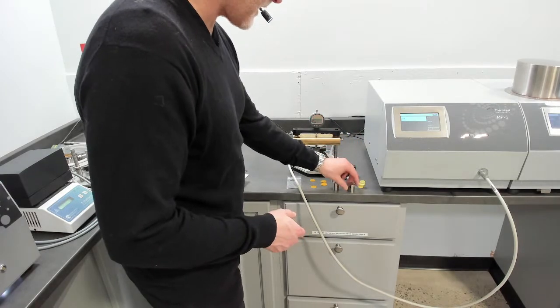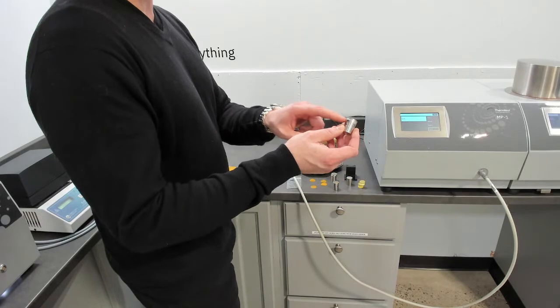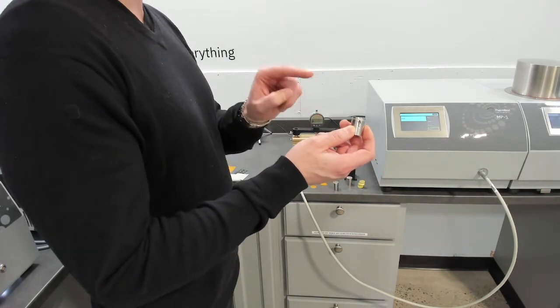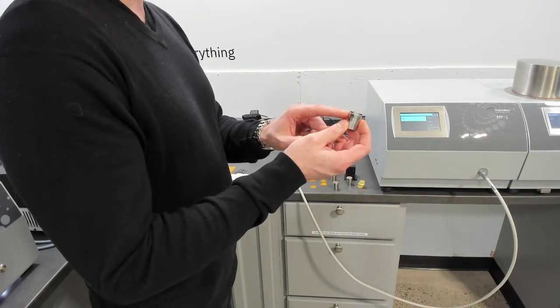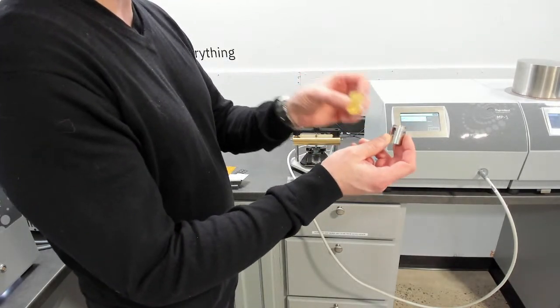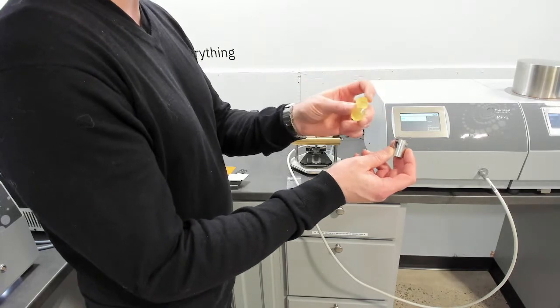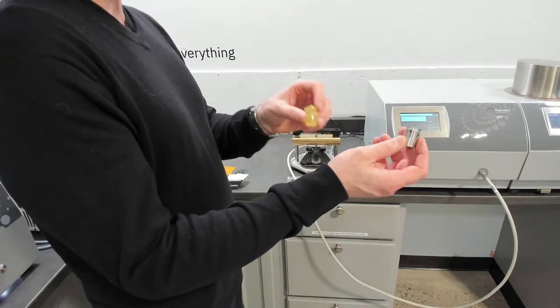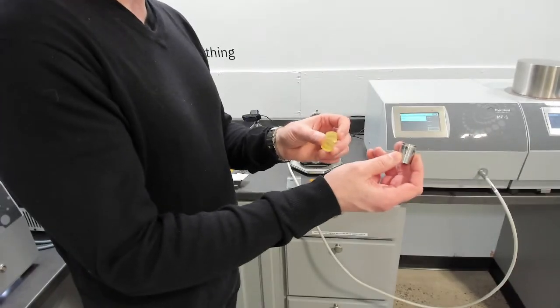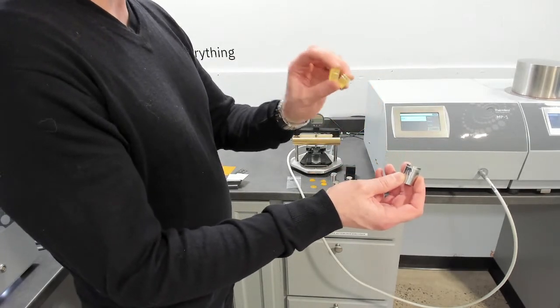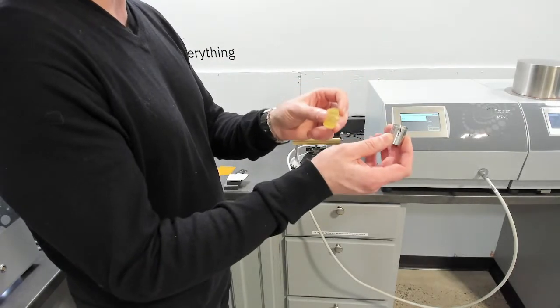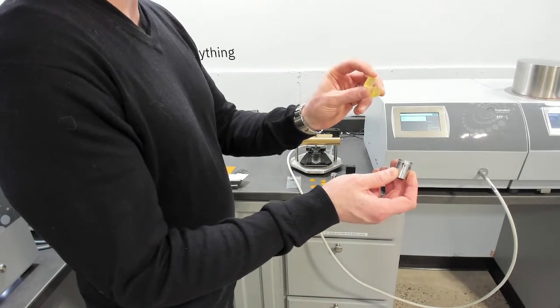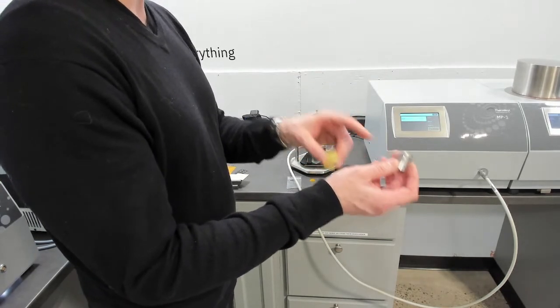If you were to test an epoxy or an adhesive, so this is the same two pieces, just with a permanent epoxy placed between them. If that added adhesive or tape is acting like a liquid layer, so if it's highly wettable and it presents good contact that acts like a liquid layer and is very similar to the bulk properties of the same material. So this is the same epoxy just poured into a mold where we measured its properties on this size scale. Now, if we compare that layer, single layer of submillimeter thickness, I don't remember what it is. It's on the order of 0.02 millimeters, I believe. And then we measure this with transient plane source, just standard bulk thermal conductivity. We get pretty good correlating results. If this had a filler in it and that filler was very large in size and that gives a very high conductivity on a bulk scale, it may not work the same in terms of its applied thickness. So that's some of the sensitivity you can pick up.